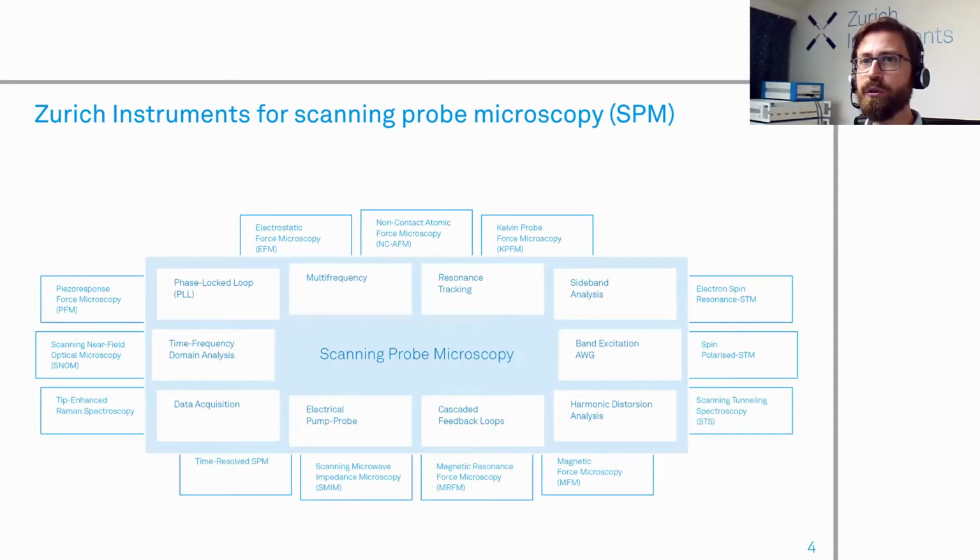Before we dive into the concrete stuff, let's situate Zurich instrument in the context of SPM application. Let's start with this cloud view of the various SPM technique. SPM comes with many flavors and modes of operation. And here's just an overview of the wealth of interaction and physics that can be probed with this, ranging from high resolution topography in ultra high vacuum, and of course, everything related to scanning tunneling microscopy, to some piezoelectric response, some magnetic response and electrical and optical sensitive techniques too. And the list could go on.